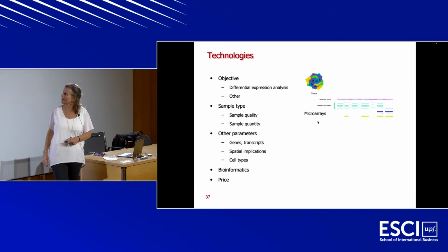So let me recap here. We have the first technology, that is the microarray technology, that was analyzing just different probes.